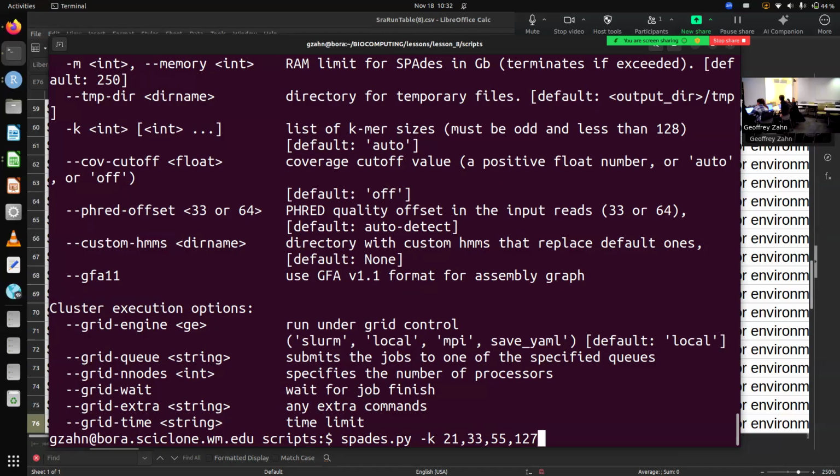We had a cutoff threshold in our quality control of 100, so our k-mer size can't be more than 100. We don't necessarily have all of our reads that long. You can do 99 there, unless you change the QC and say a cutoff of 150.